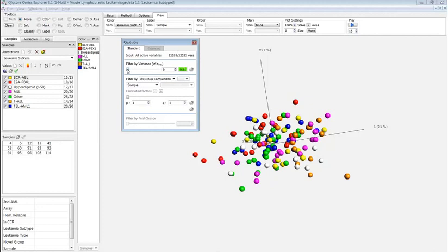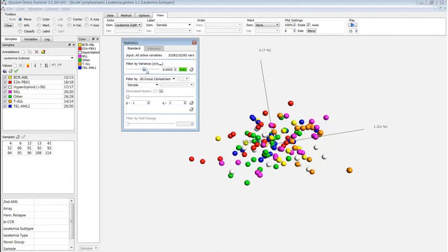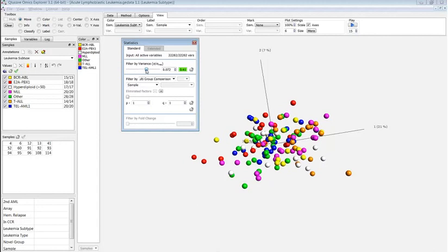So now I will start by filtering by variance. Initially we have a green light, and it's quite a high value. As I continue to filter, things start to happen when I go under a certain level of variance. It's still green, and if you look at the lower left corner, we have about 21,000 variables left.